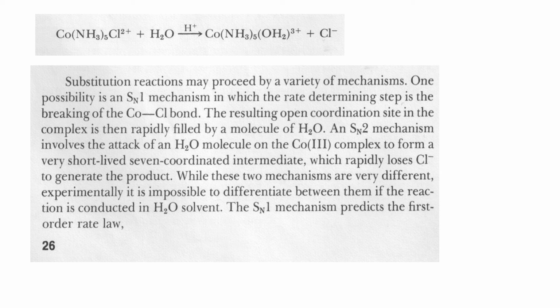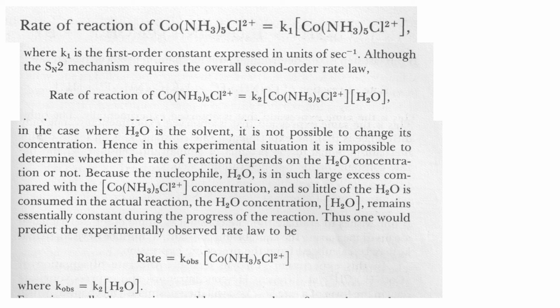Now, the mechanism of the substitution reaction has either an associative or dissociative mechanism, or IA or ID mechanism, interchange, depending on the complex and the environment. If we check the possibilities, the rate of reaction of the complex, which is colored, is followed by the absorbance at lambda max, and equals K1 times the concentration of the complex.